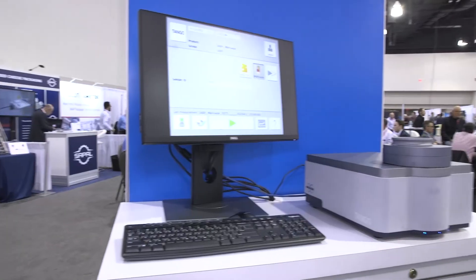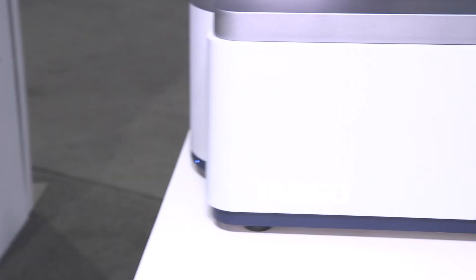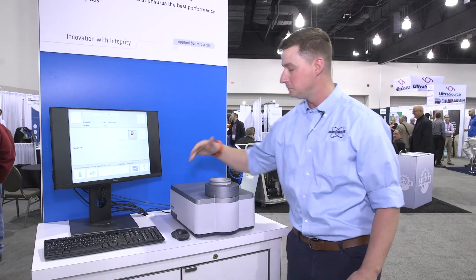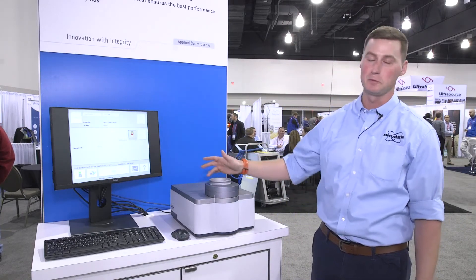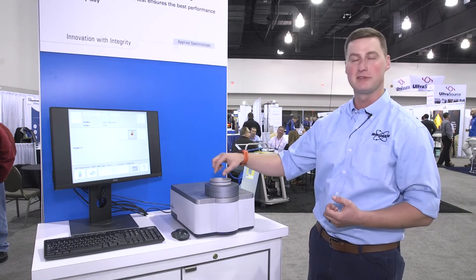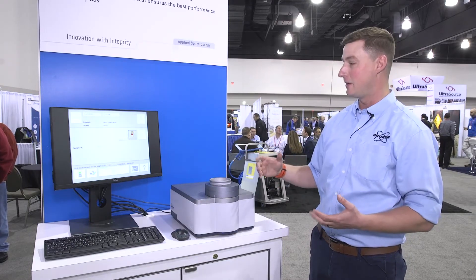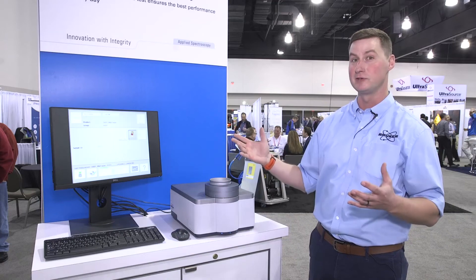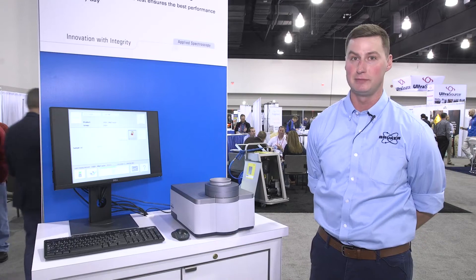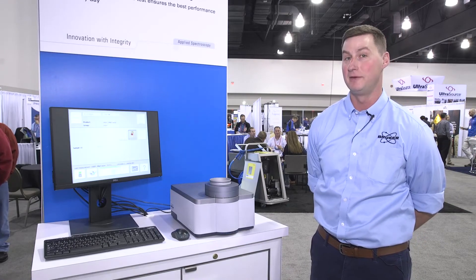In order to run a sample, it's very simple. The sample goes in a cup on the rotator. You select a product on the screen and hit go. At that point, the sample will start to spin so we're able to see all of the sample in that cup. Once it's done, it's going to show your result, and that data can be exported to a central data management location of your choosing.